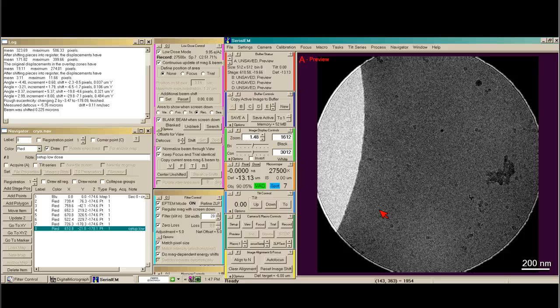So when we take tilt series, I usually set up my 0 degree image to be 1 electron per angstrom squared, and then the way we set up the beam intensity during the tilt series acquisition means that at 60 degrees my beam will be 2 electrons per angstrom squared. The idea here is that you might have holes next to each other in the carbon that you might want to take tilt series of. If you let the beam get too big, you will be burning areas of the grid that you might need later for more tilt series acquisition.